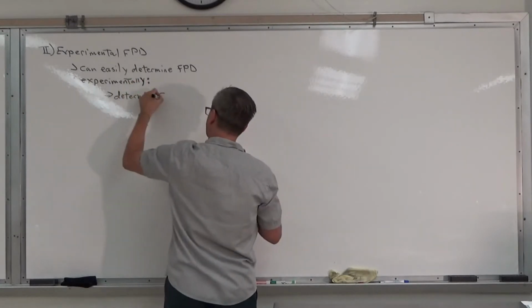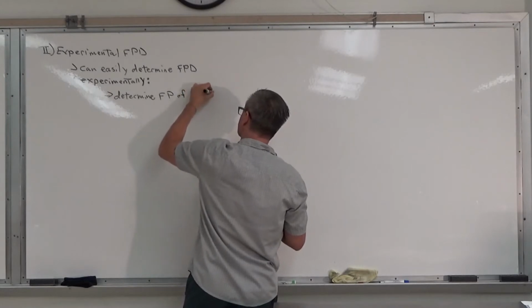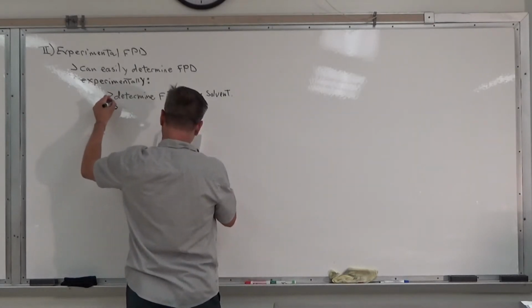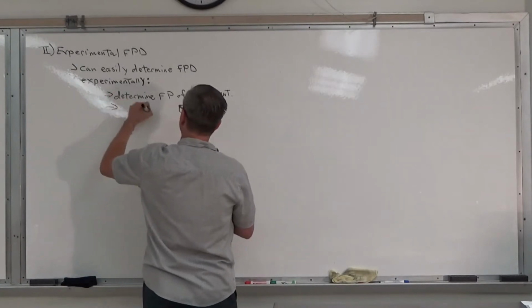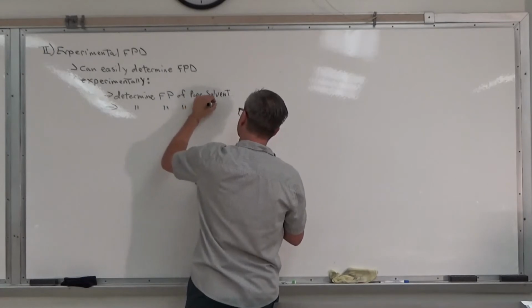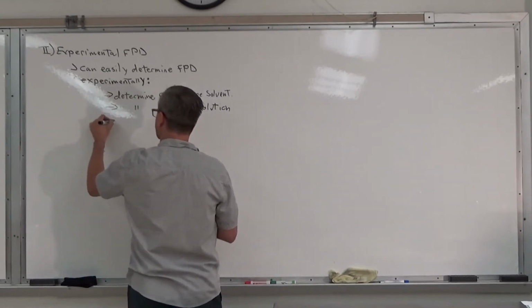Determine the freezing point of pure solvent. Determine the freezing point of solution, and take the difference.